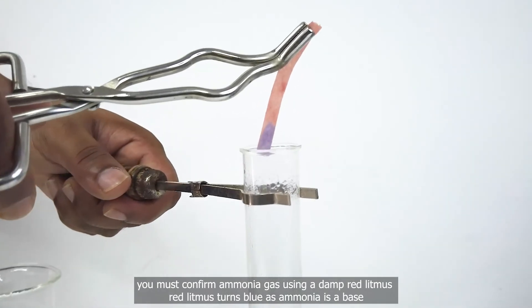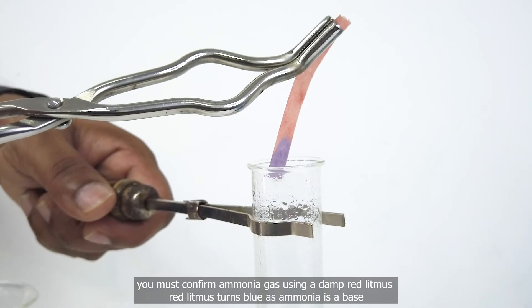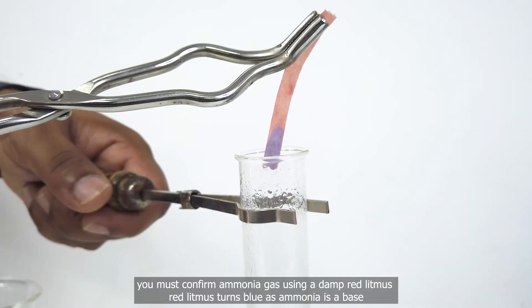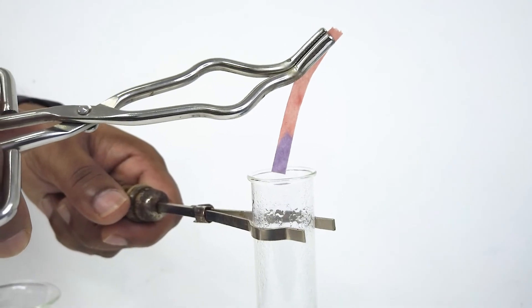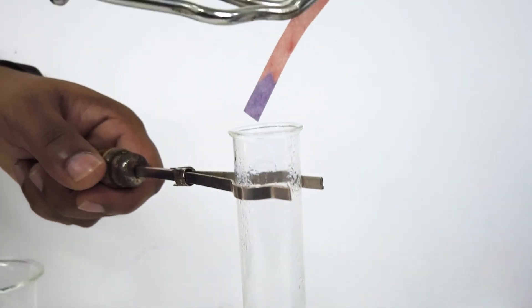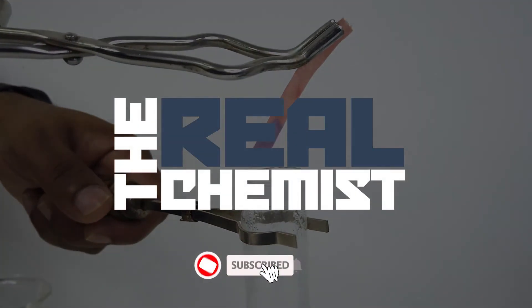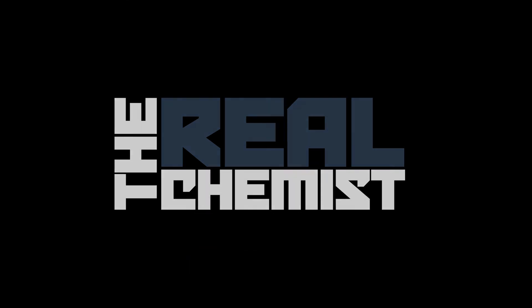You must confirm ammonia gas using a damp red litmus. Red litmus turns blue, as ammonia is a base. You must confirm it.